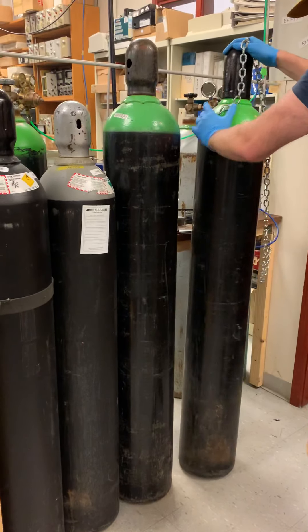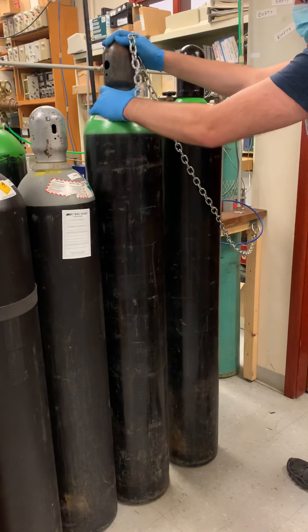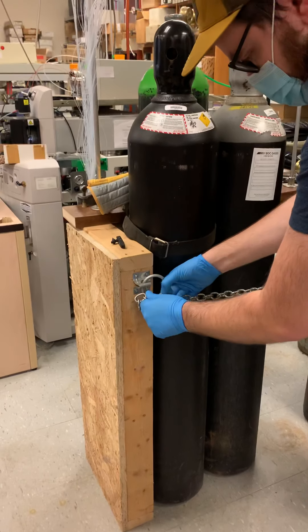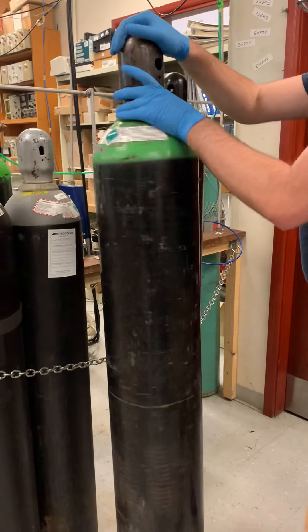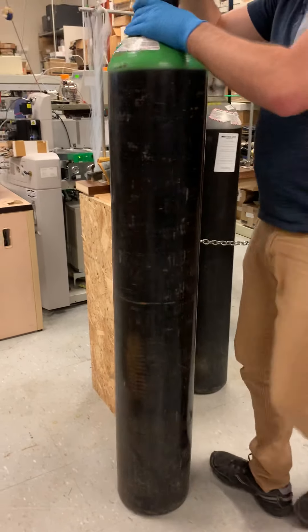These are the spare cylinders. They are kept safe behind this chain. But when we put them into position for the instrument, they will be tied up. They're just collected like this so that the stores department can collect them and return them easily.